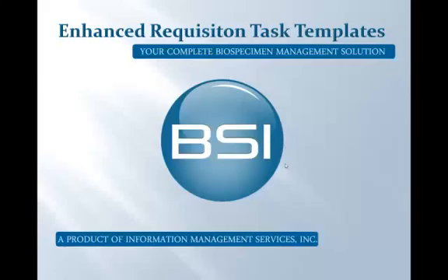Hello. In this presentation, I will introduce and demonstrate changes to the Requisition Task Templates, as well as provide information for testing and requesting this functionality on your BSI database.